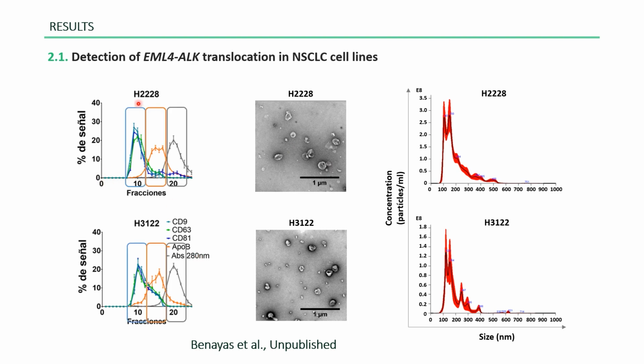And then with this size exclusion chromatography, we could interrogate separately the extracellular vesicles fraction, or the lipoprotein enriched fraction, or the soluble protein fraction of our conditioned media.